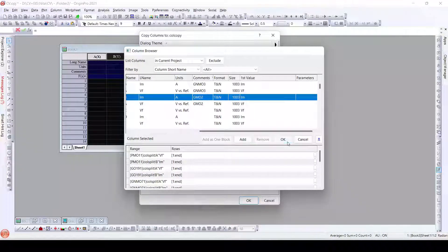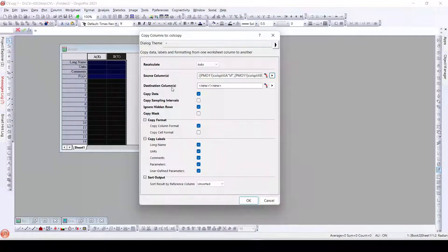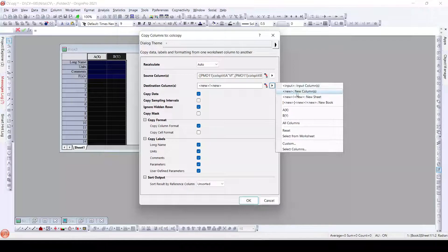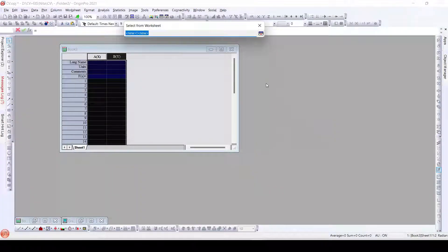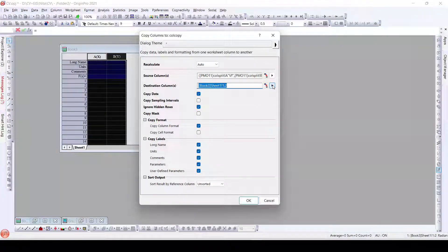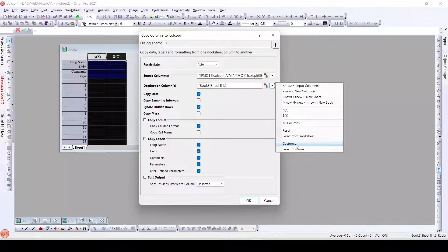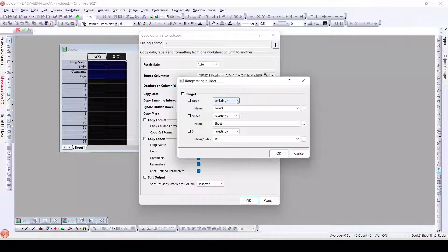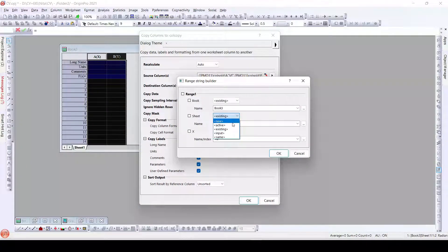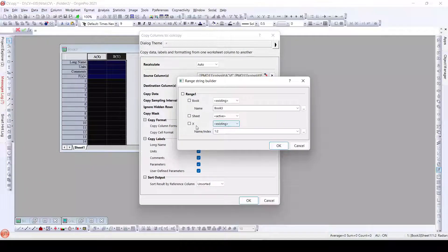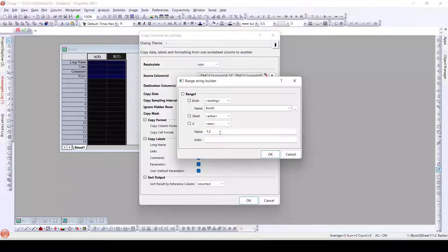So all the columns are added — just click OK. Now in this particular dialog what we have is destination columns. We can select them from the worksheet or we can select the columns. Instead of the default selection, what we will do is go to Custom, and here for Book select the existing workbook — Book 3, as we can see. For Sheet, select the same active sheet that we have. For Columns, instead of existing we can use New. And now I will click OK.